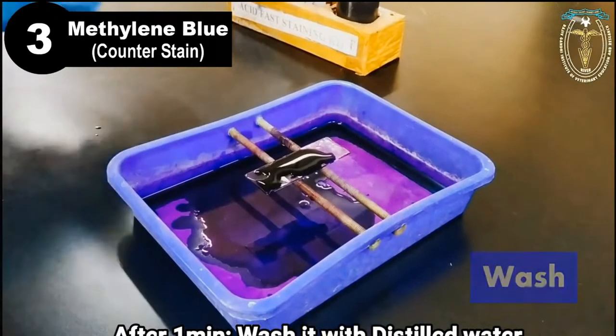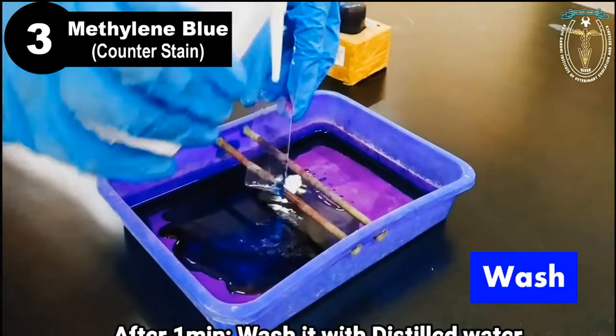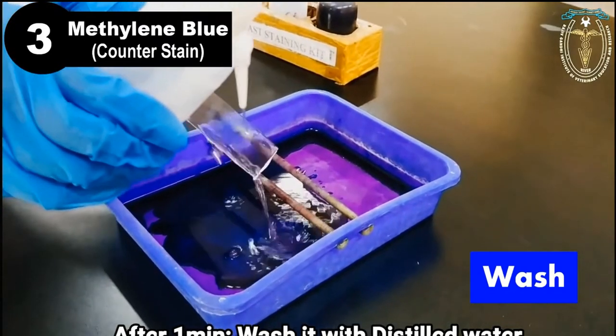Okay, so additional note. Okay. For the methylene blue, it is applied only on the smear.